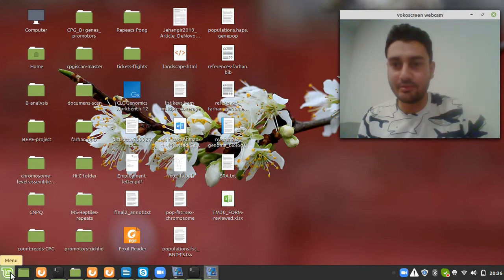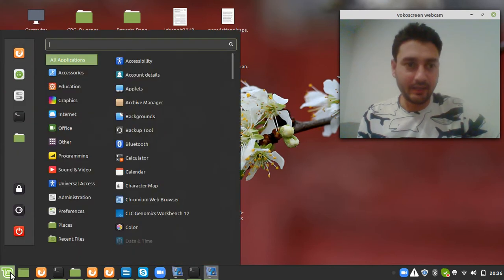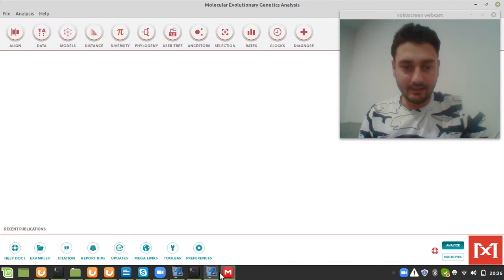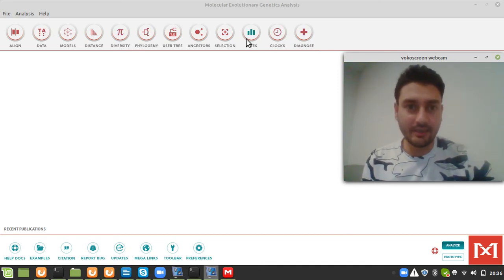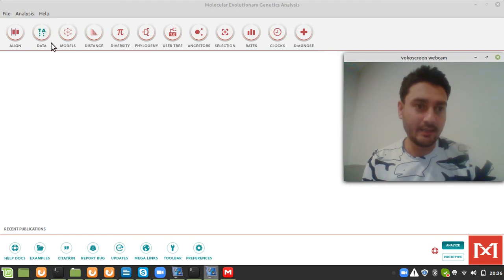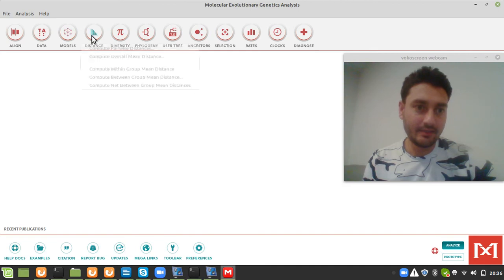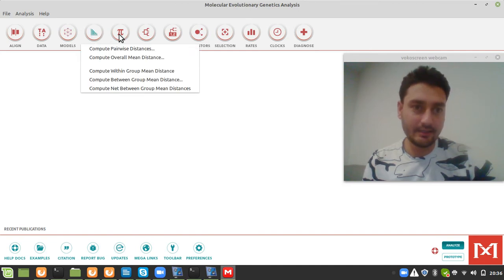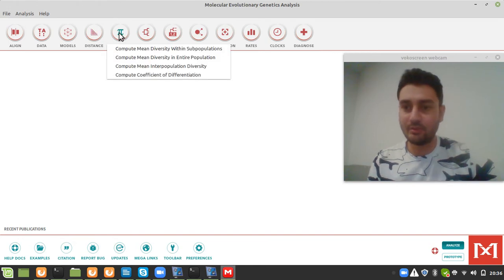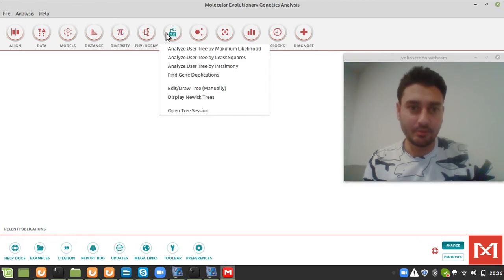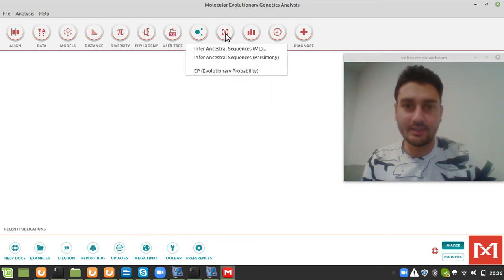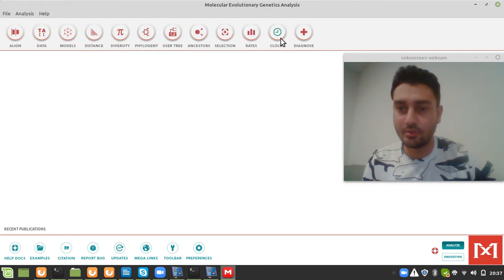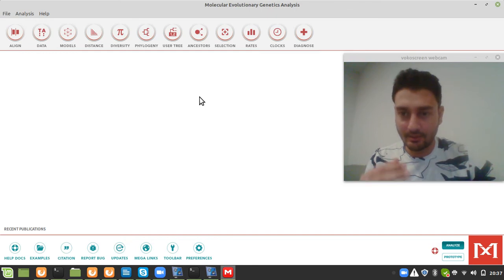First of all, as I mentioned in the last zoom discussion, we need to open the MEGA file. In MEGA you have different types of analysis tabs and options — you can do alignments, use different models, run distance computational analysis, measure nucleotide diversity between populations, display phylogenetic trees, and also do mutation rate and clock analysis that we are going to use in this project.